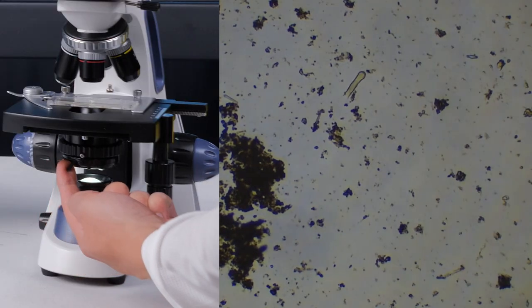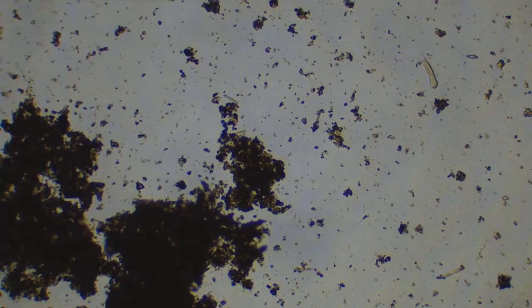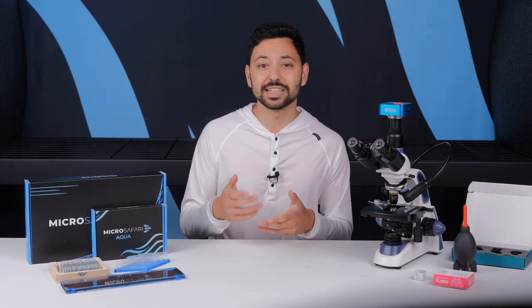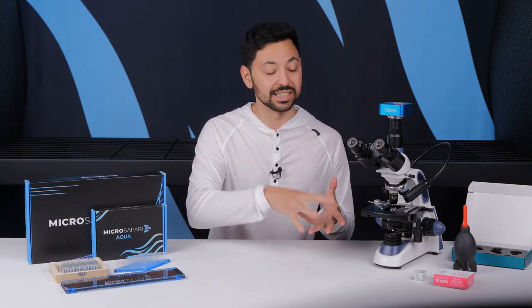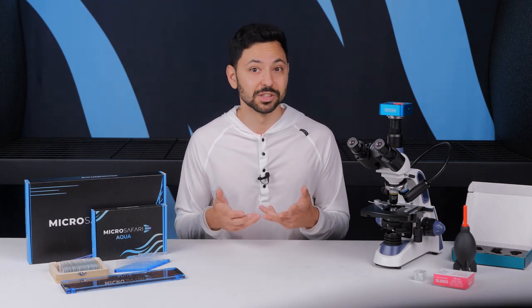As a rule of thumb having the condenser iris all the way closed will give the highest contrast. So for example if you're looking at a bacteria that's barely visible, closing down the condenser iris will make the edges of the bacteria much more visible. The downside is that closing the condenser iris will also make any dust that's inside of the microscope optical train appear much more visible. This also increases the depth of field.